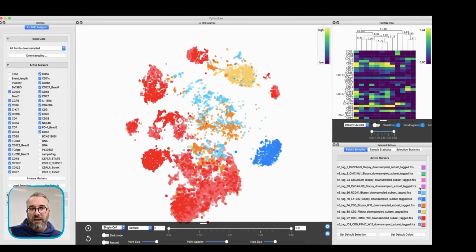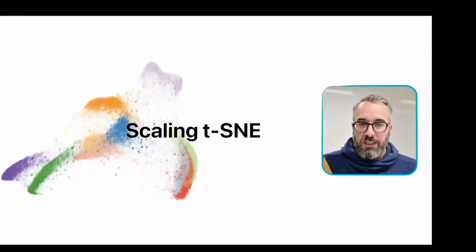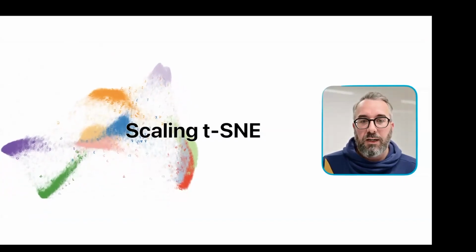But I hope you get the idea that we want to have these interactions directly between these different views. We want to see what's in a cluster, what we actually see there, so that we can interpret the data. But as I said before, if we want this in an explorative visualization setting, then especially the TSNE becomes a bottleneck if we want to compute it quickly, right? So in this first part, I want to look at how we make this fast.